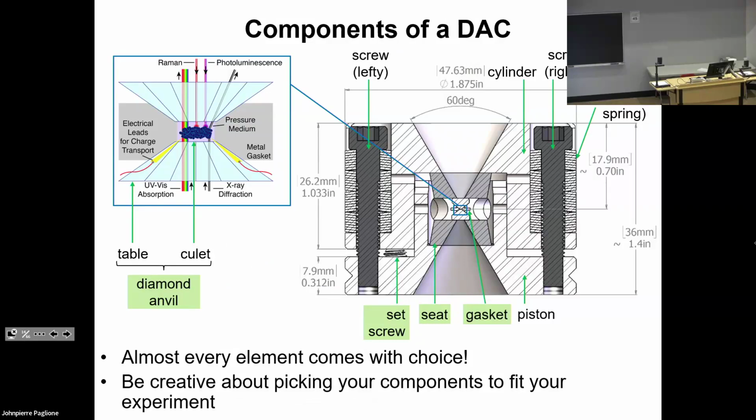And of course, the diamond shape and how it's cut in particular will dictate your maximum pressure, in addition to what the culet size is, just as a function of, is the diamond going to survive? Is it going to be strong enough? But those diamonds are then mounted on seats, which have a little hole in the back that opens towards this conical opening. That conical opening, part of both the diamond anvil cell itself but also the seat, also dictates, for example, what range in 2 theta or scattering vector you can access. And so the choice of seat becomes very important.